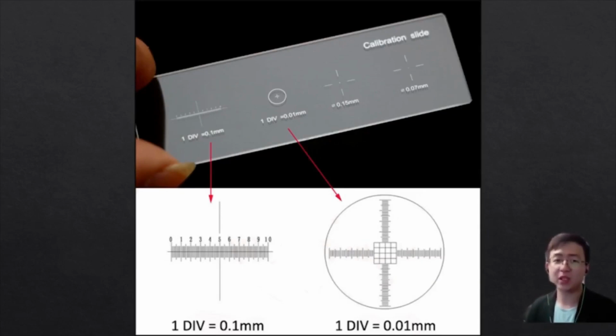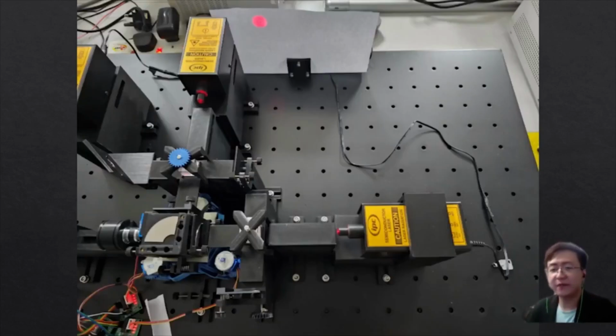However, for optic application, nanometer discrepancy can cause huge effect on the project itself. Therefore, interferometry is employed as it is sensitive enough to detect nanoscale movement. By utilizing 3D printed parts for interferometry, the experiment setup can be cost-effective and guidelines can be designed to assist in the alignment process.